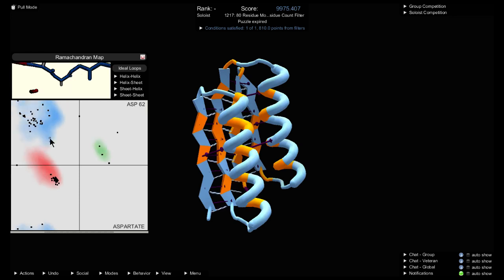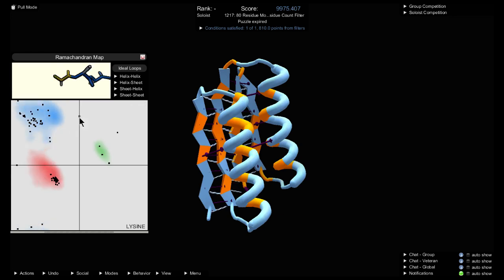What about these two down here? This one is an aspartate, and it has blue down here where the dot is, so this one is inside the colored area, so it's realistic. What about this one? This one is segment number one, and segment number one is always going to have its dot on the y-axis, on this vertical line. So it will often not be in a colored area, but because it's an end segment, you really don't have to worry about it. You can ignore the dot on the y-axis.